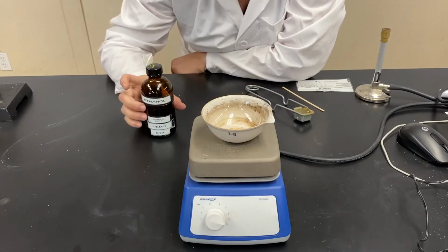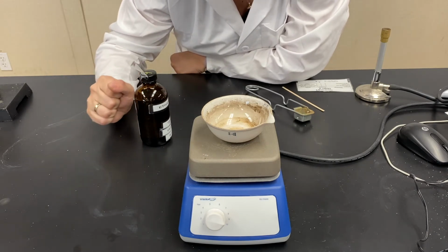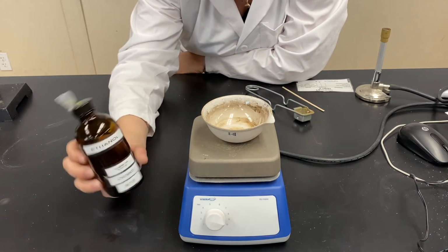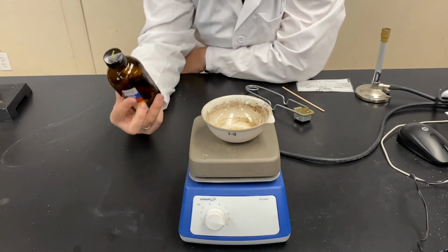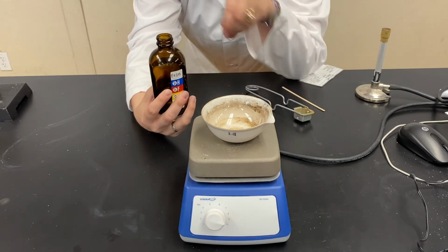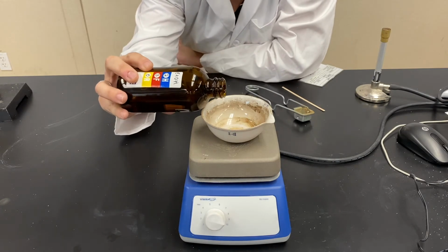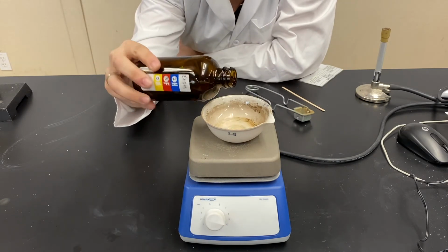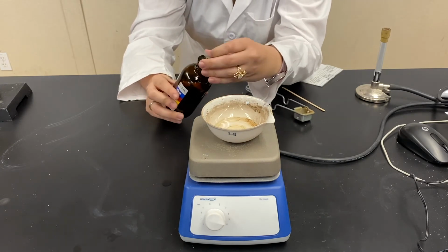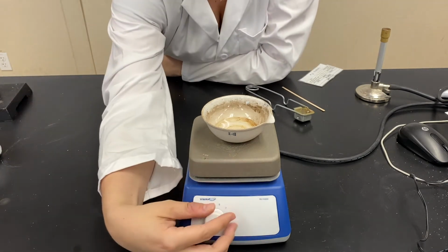Okay, and our last demo is a combustion reaction, although technically we did already see one, right? That magnesium plus oxygen is also a combustion one, but this one, we have ethanol, which is a liquid at room temperature, okay? So we have ethanol and we're gonna light it on fire. So we're gonna add some ethanol to this evaporating dish. And then it's on a heating plate, so we're gonna warm it up a little bit.